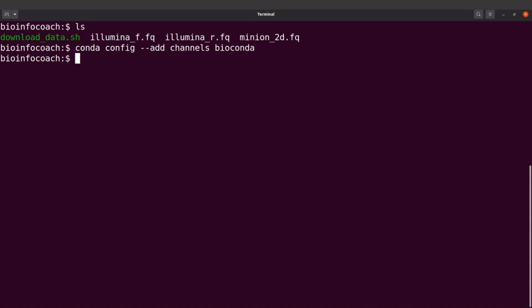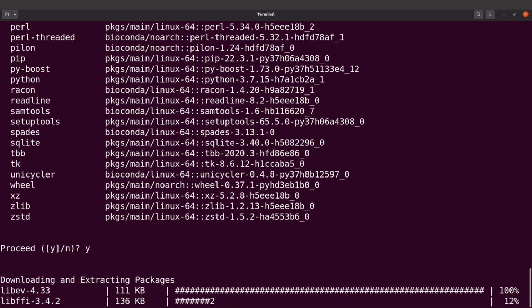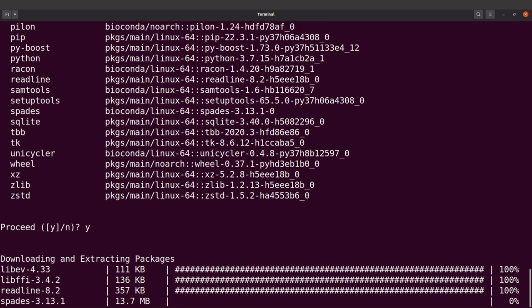The channel has been added, so now I'm going to create an environment and install unicycler in it. So I'll say conda create -n assembly unicycler, and then I'm going to install it. So let's execute this command. Okay, I am now going to type Y to confirm. Once I do that, conda will download all the necessary packages, install, and then configure them for us. So let's wait for conda to finish its work.